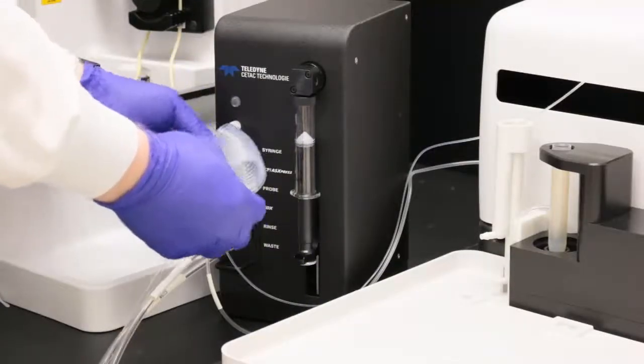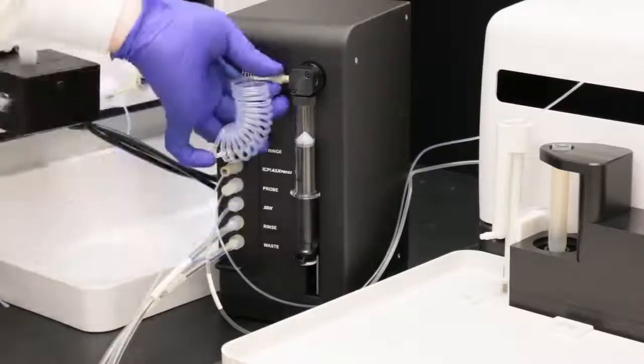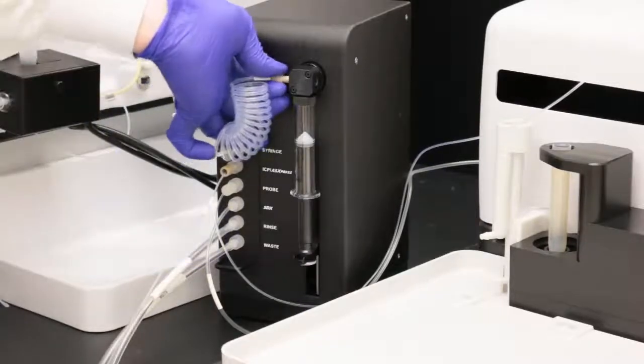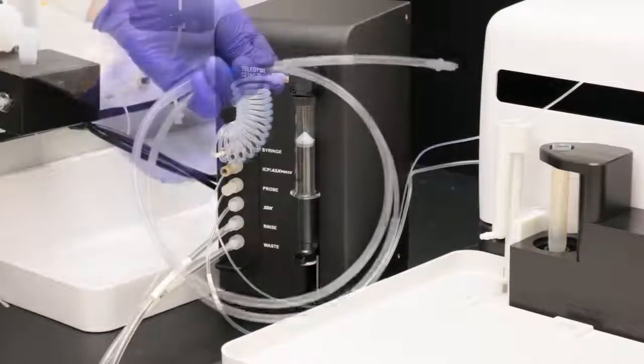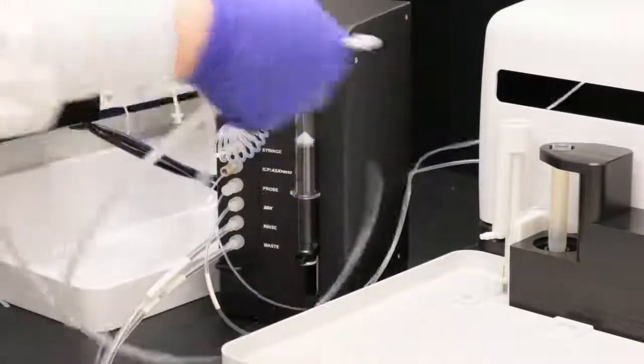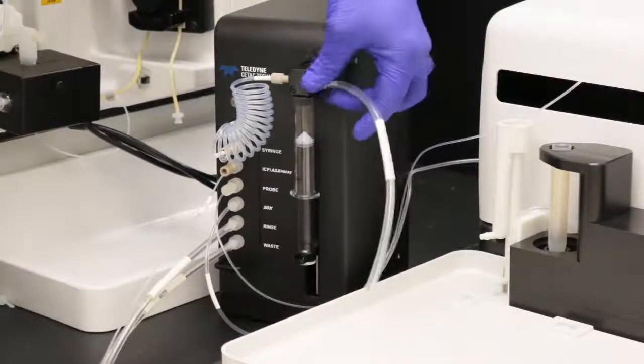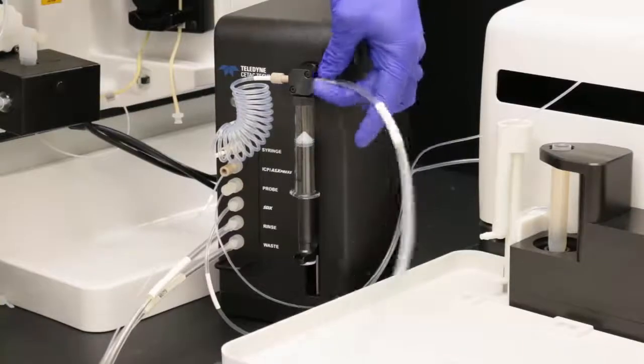Connect one end of the sample loop to the syringe connector and the other end to the left side of the valve. Connect the syringe diluent tube to the right side of the valve. Place the other end of the syringe diluent tube into the bottle of diluent.